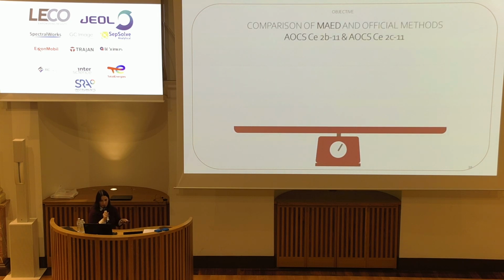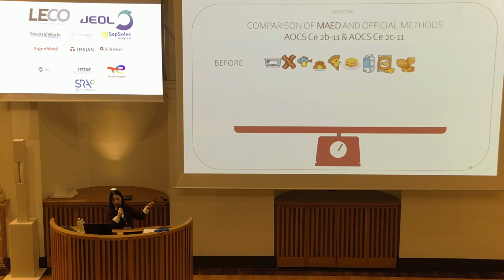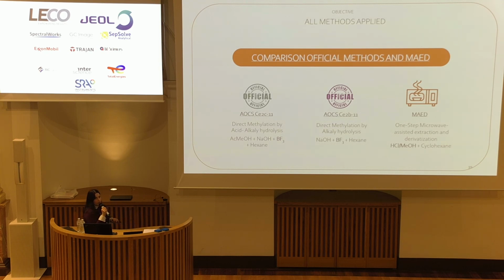So for the first objective, we are going to compare MAED, so one-step microwave-assisted extraction and derivatization, to two official methods. This is an extension of a previous work where this comparison was made on these matrices. We chose another batch. Here is the characterization of the methods that we compared. We have the AOCS official methods that use conventional heating and BF3 for derivatization, and MAED, which is one step and also replaces BF3 with a less toxic agent, an acidic solution of methanol.